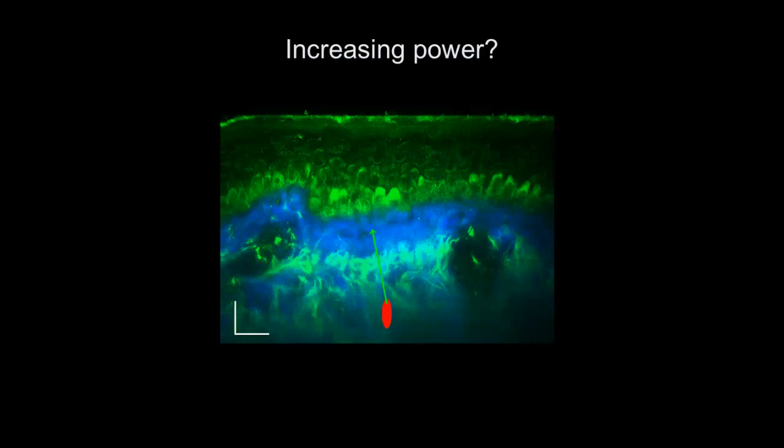But the main killer here is this. You have to bring this light all the way into there. Up here, where the illumination cone is wide, you normally don't generate a lot of light. But if you crank up the power here, especially at the interface where nothing has been scattered yet, you actually have a very high photon flux. And what happens is, at these regions here, you actually start generating light out of focus.